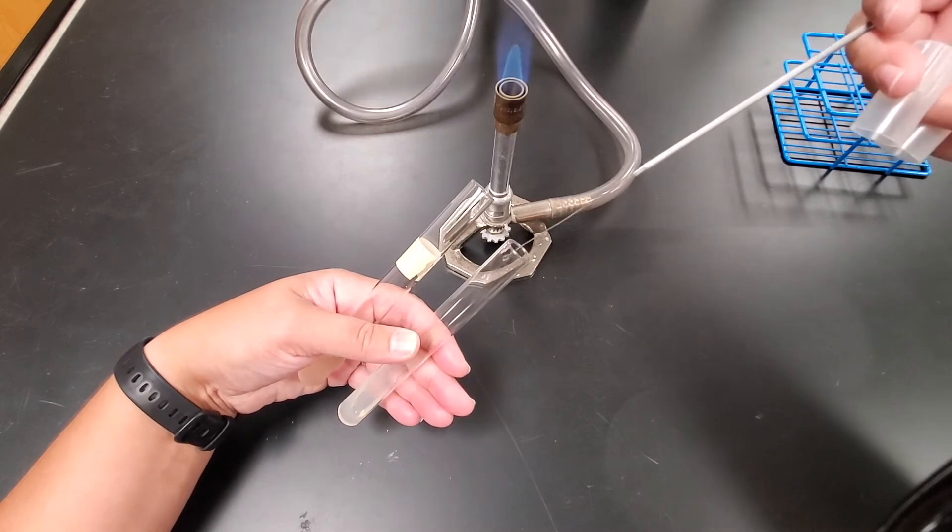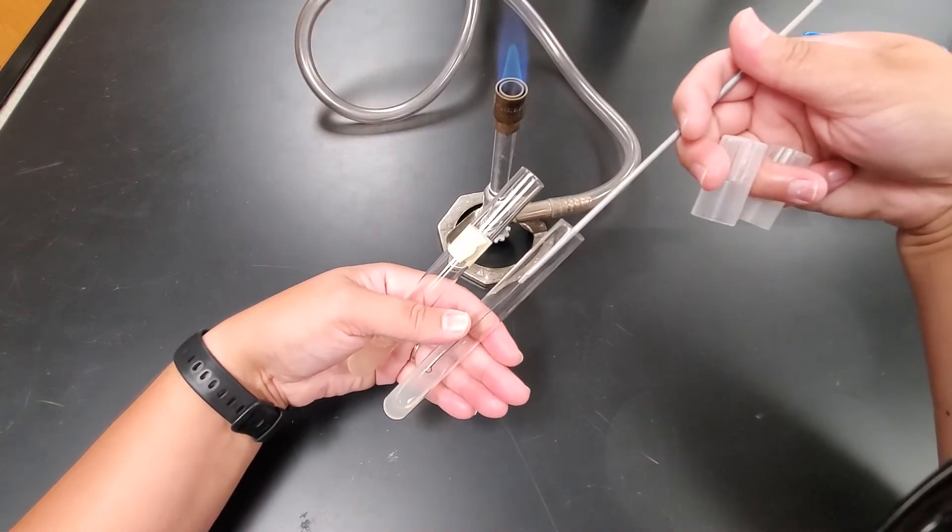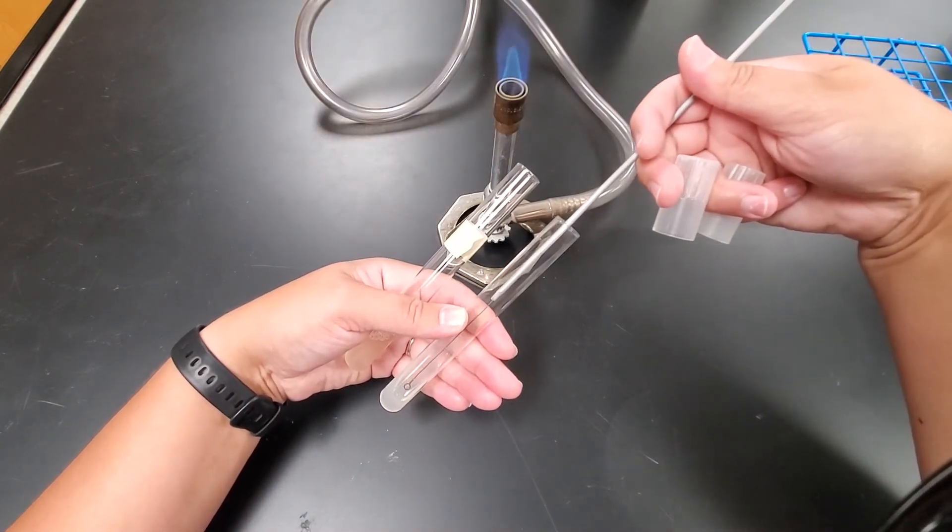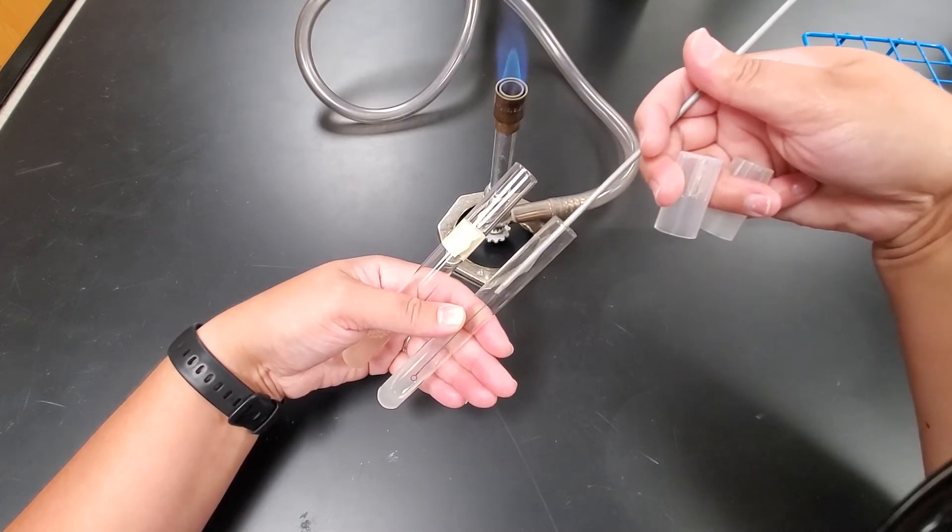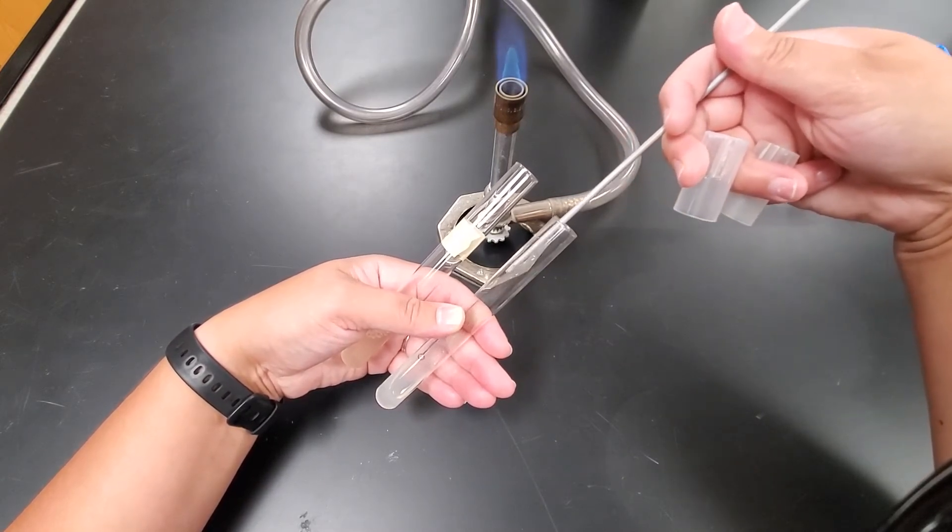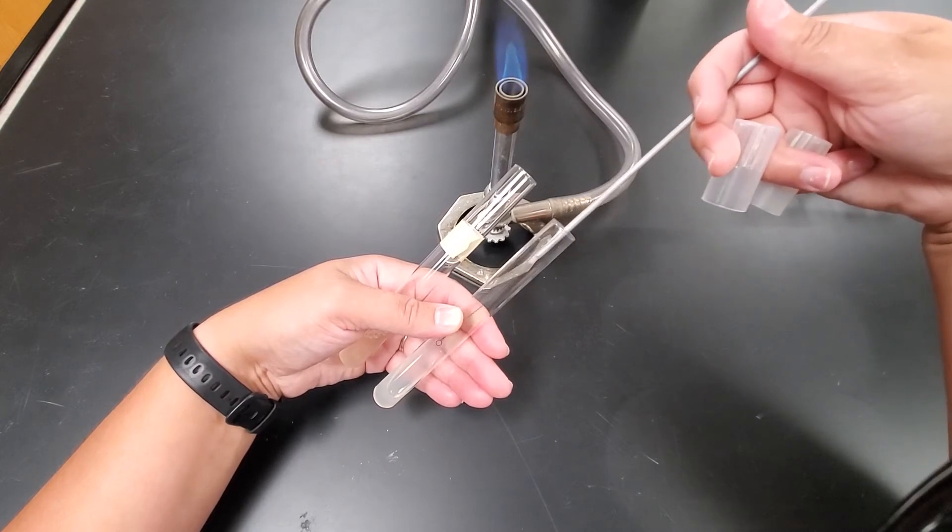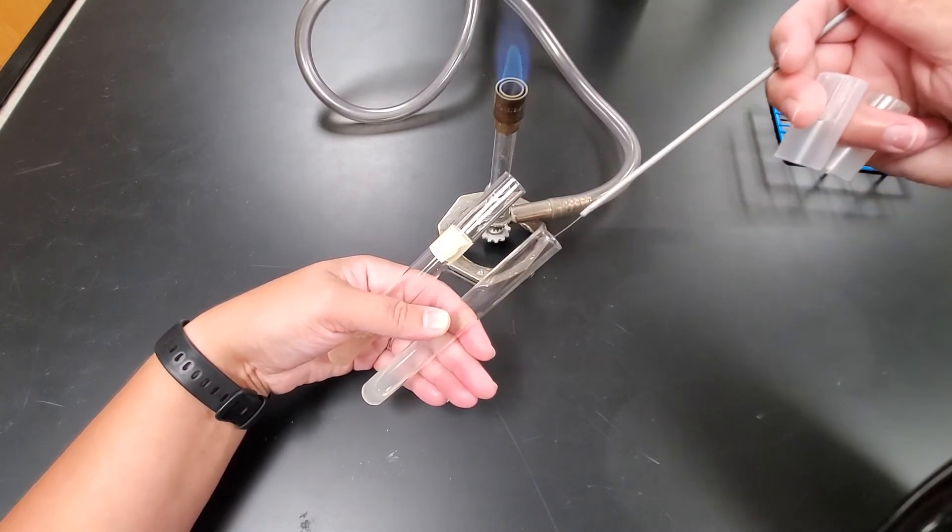So now I want to go into the agar slant, being careful not to touch the sides of the tube. And I want to start at the base and then zigzag my way up. So you can see how I'm zigzagging that sample that I just grabbed. Once I get to the top, I'm going to go ahead and re-flame my loop.